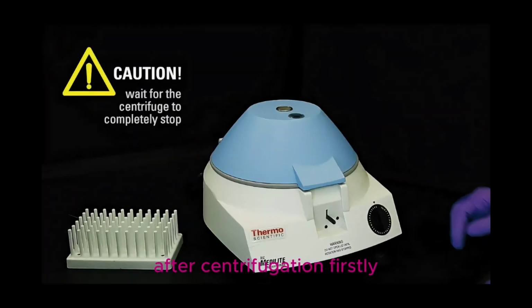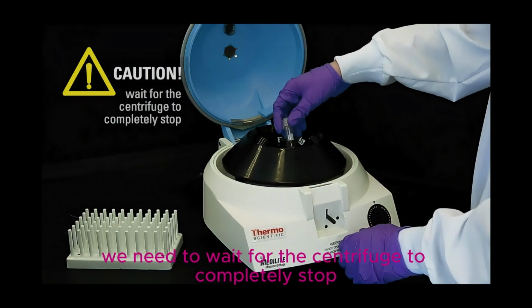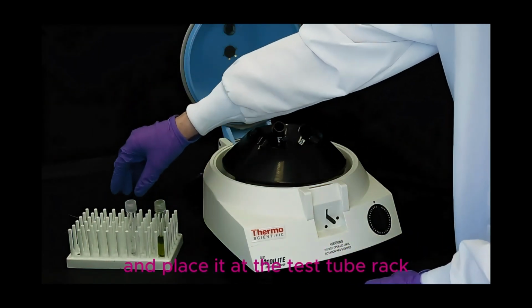After centrifugation, firstly we need to wait for the centrifuge to completely stop before removing the tube carefully from the centrifuge machine and placing it in the test tube rack.